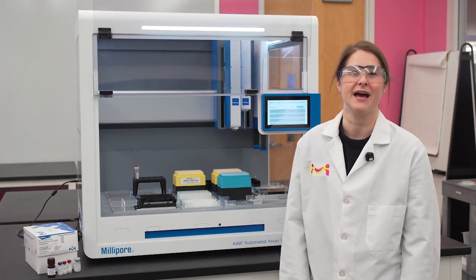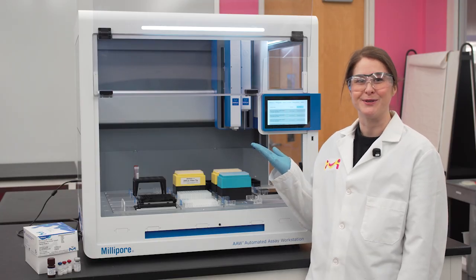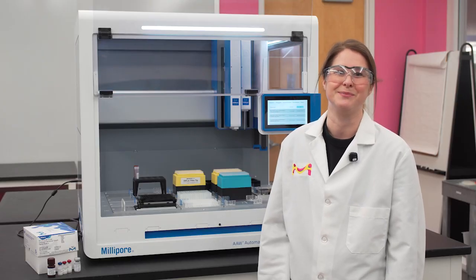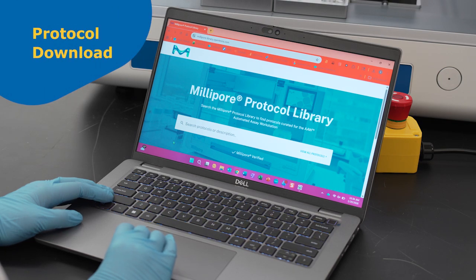I'm going to demonstrate how to run the MILLIPLEX Human Cytokine Panel A kit on the AAW Workstation. This demo will highlight that assay automation helps reduce hands-on assay time and human error while maintaining consistent, high-quality results in multiplex immunoassays.